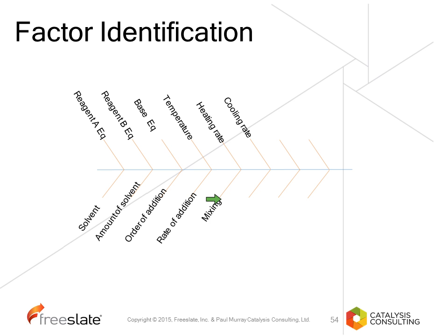From my experience, if you cannot identify at least 12, but preferably 15 to 20 factors, then you have not thought about your process sufficiently. This is not saying that you will investigate 15 to 20 factors, but you should try and identify all the factors that could be important.